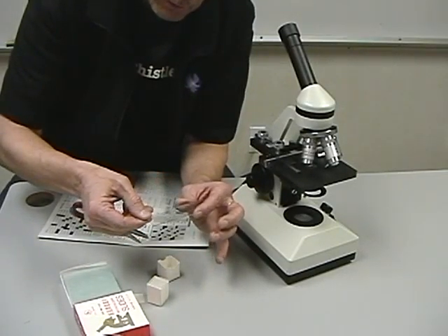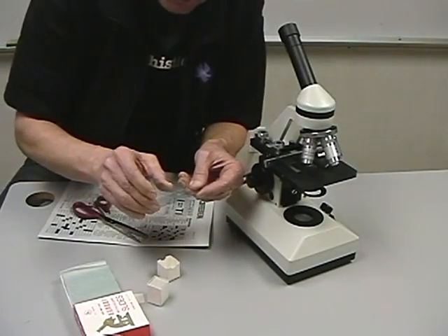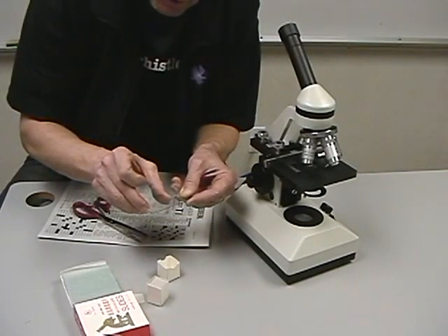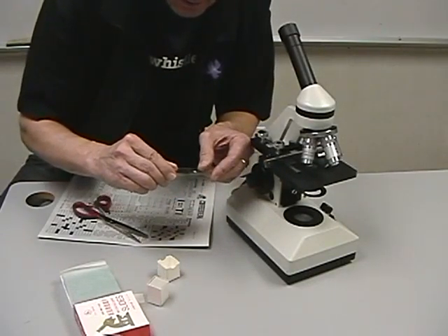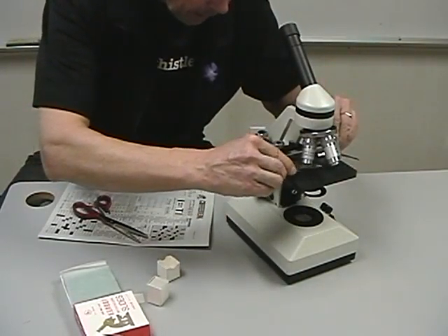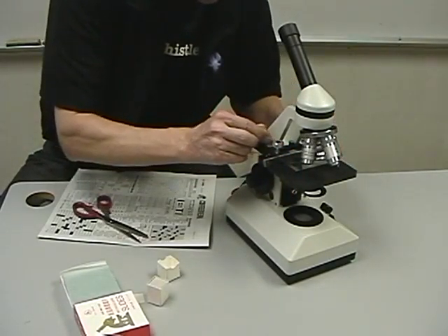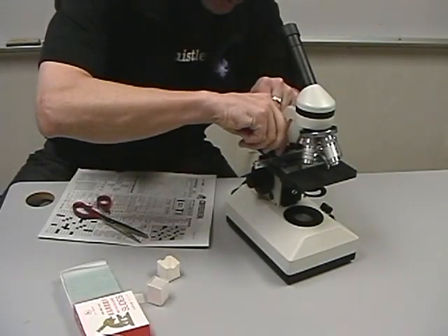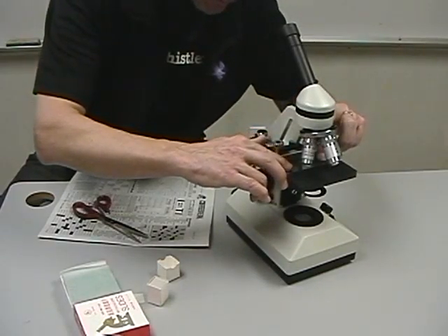There it is. Now we're going to be placing it under the microscope, and we might need to touch it up so that we're looking at it directly as the letter E. So I'm going to turn this around so now it's pretty much facing me as the letter E. Alright, so I'm going to unfasten that, slide it under here, put the fastener back on, and just adjust it approximately where it should go under that little lens that you can see down below. So just coming up a little bit here, it's fine.